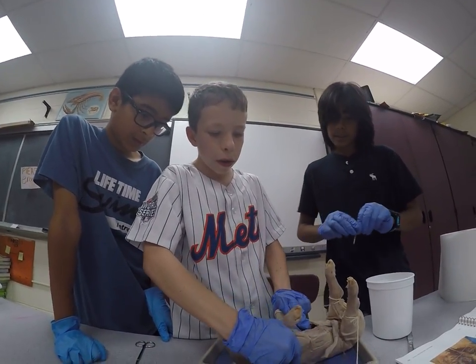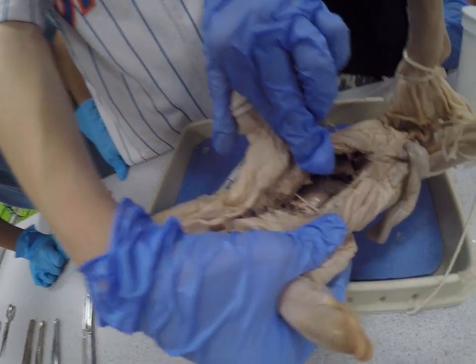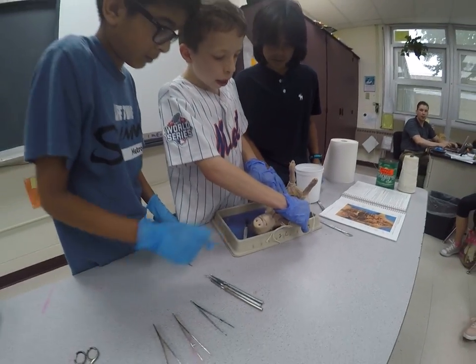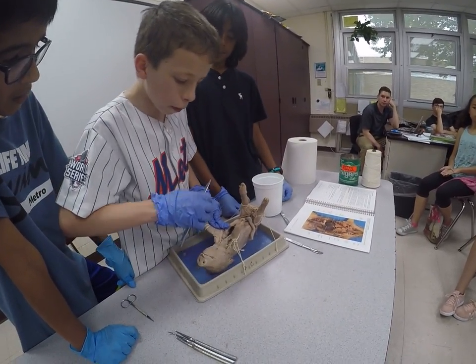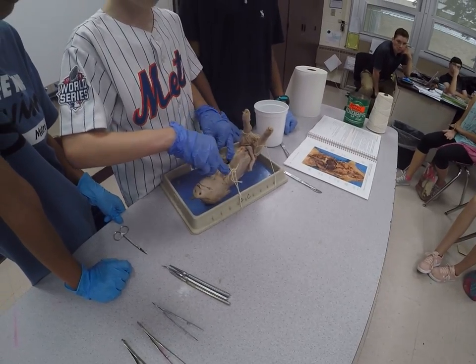Now you can see the internal organs. If you guys are disgusted, you can just close your eyes or go to the back. And if you see down here, you can see the liver, or possibly the bladder — it's hard to tell right now, probably the liver. And if I cut even deeper up here, you will see the heart soon.